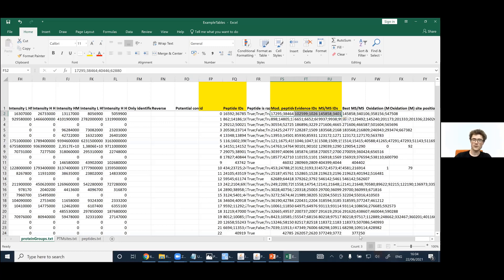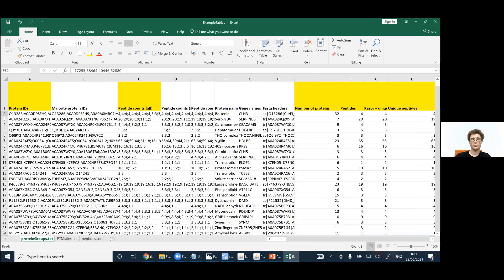So that's the protein groups table — it provides a lot of information. As we have this open, I'll also quickly go through the other example tables, some of which will be covered on Thursday. Here is, for example, the peptides table.